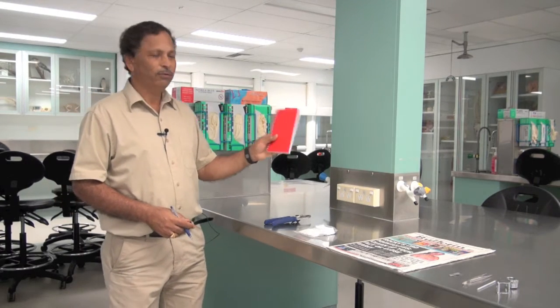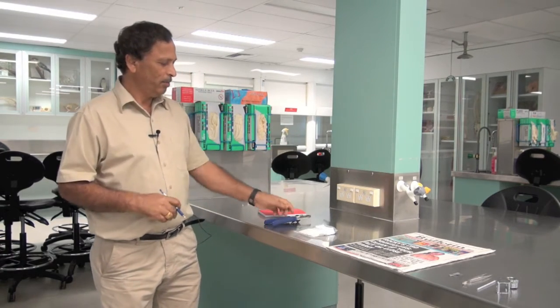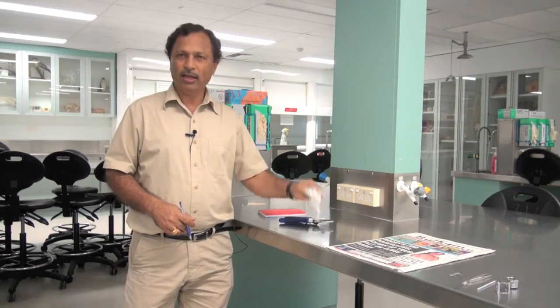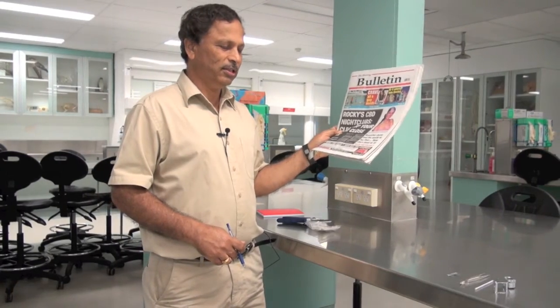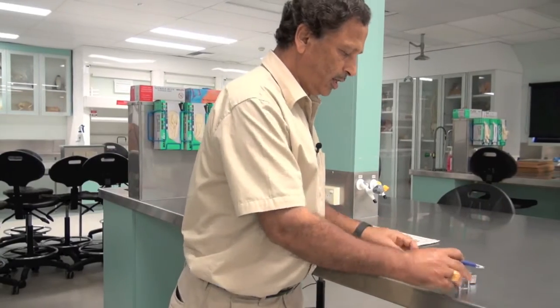First of all, you need a field notebook, something like this, a pen, a pair of secateurs, some price tags, and some old newspapers, A3 size. And you also need the dissection kit.